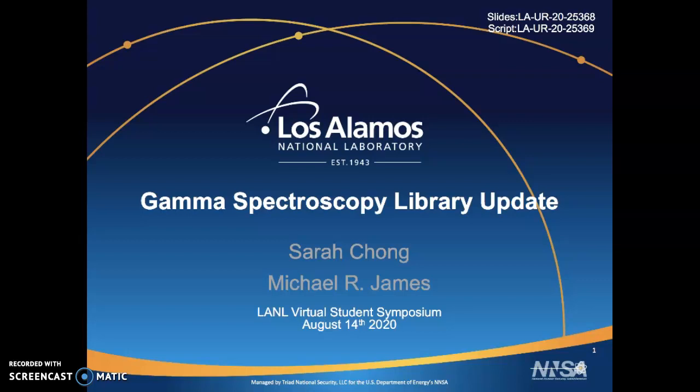This summer, my mentor, Dr. Michael R. James, and I are working to update the gamma spectroscopy libraries and analyze the effects it will have in simple data processing and analysis.